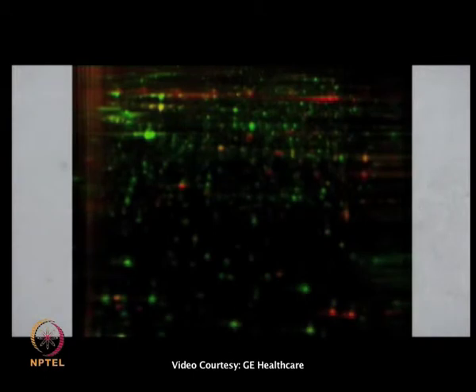The result from this 2D gel shows high resolution of membrane proteins in the sample, even if there are some known restrictions for hydrophobic proteins to be detected in a 2D gel. The results show many new cell surface label spots, shown here in red, that are not detected using the standard labeling protocol shown here in green.